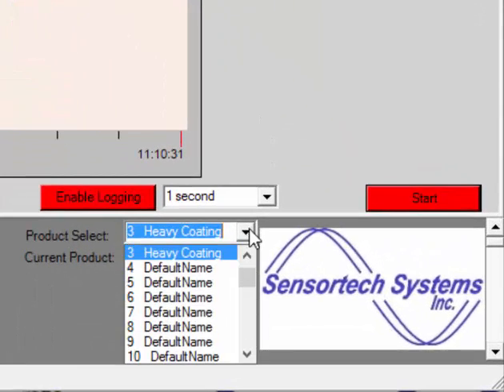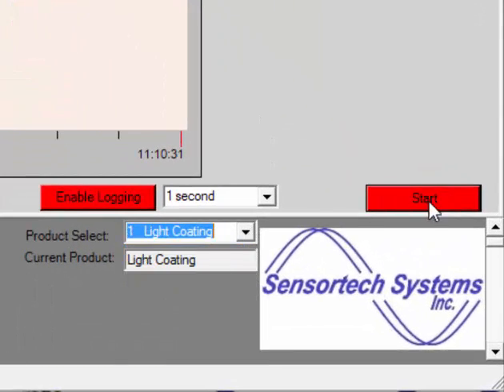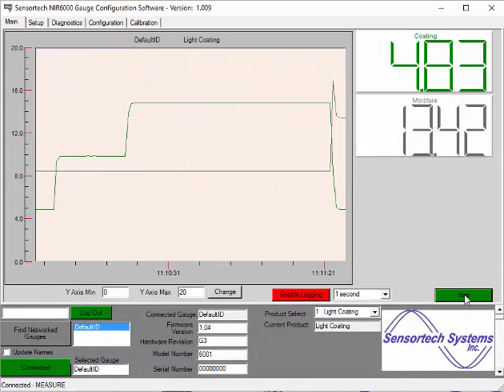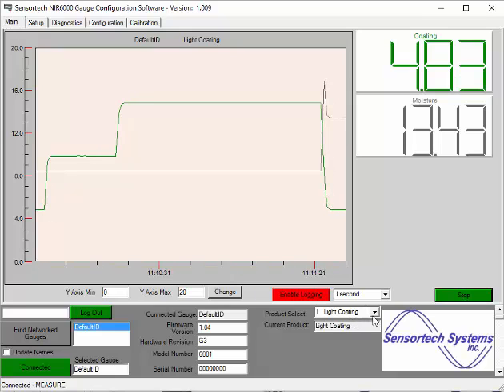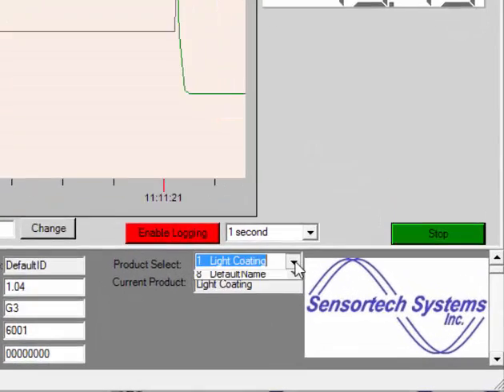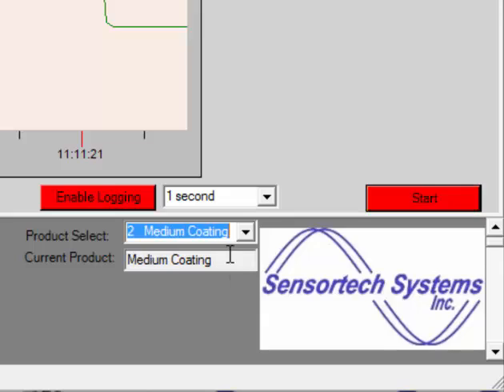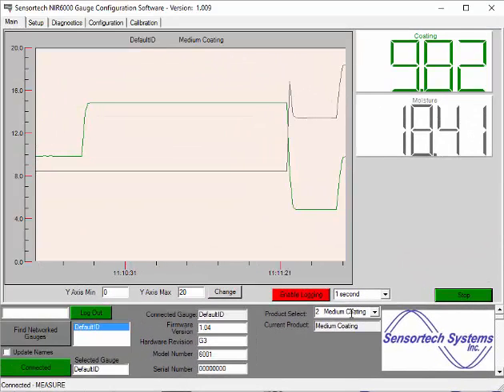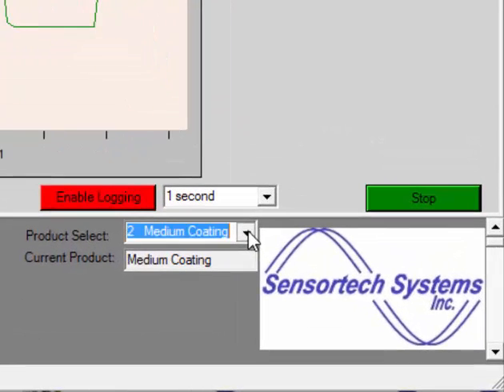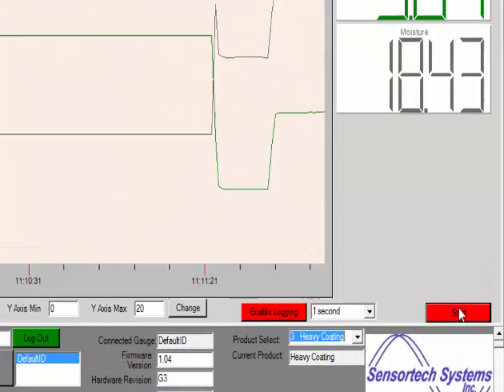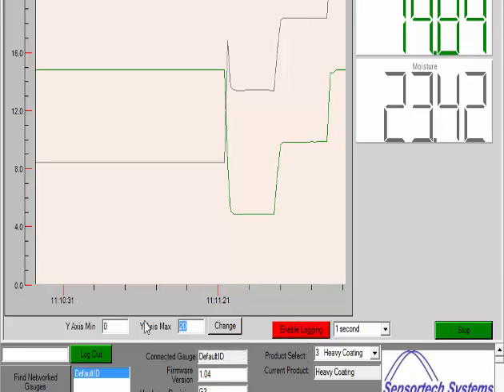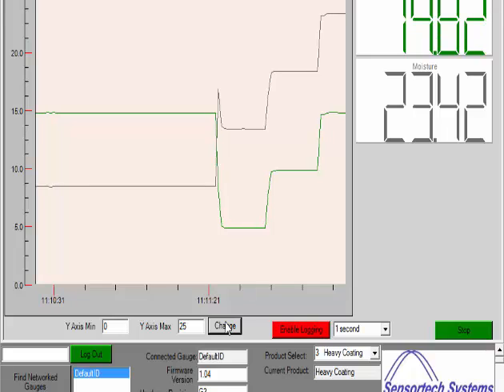Switching back to the main tab, we will resume polling data starting with the light coating product or calibration code. You will notice a change in the moisture measurement as we had changed the C coefficient, or y-intercept, of the moisture calibration. We switch to medium coating and see the moisture measurement change as we would expect. Finally, we do the same for heavy coating and see the measurement change for a third time. We must change the scale of the graph to include the final heavy coating measurement.